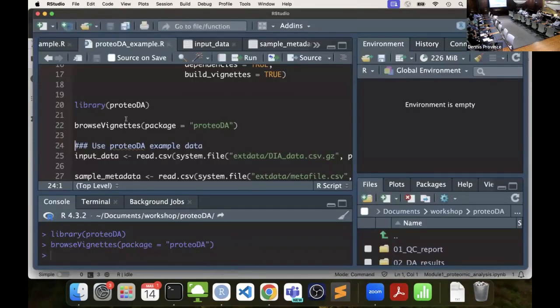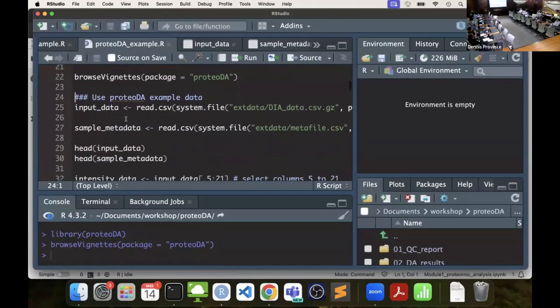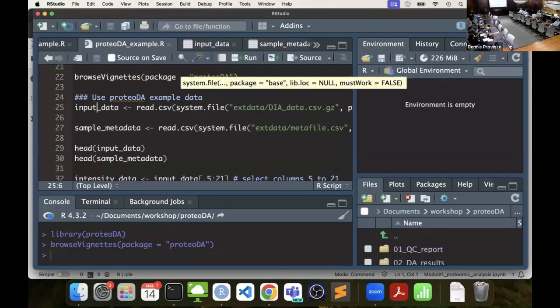But all right, so like I said, the hardest part is really getting your data put into the system itself. So the package itself includes an example data file, which is this code here that you're going to have. Whenever you're doing R, whatever is on the left side of this little arrow is what you're defining, you're defining that particular term.